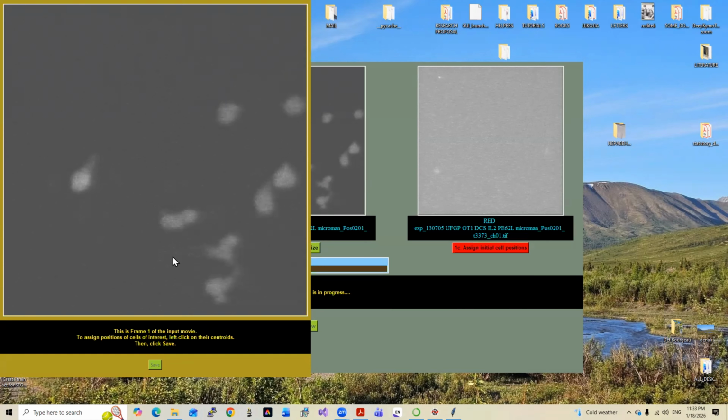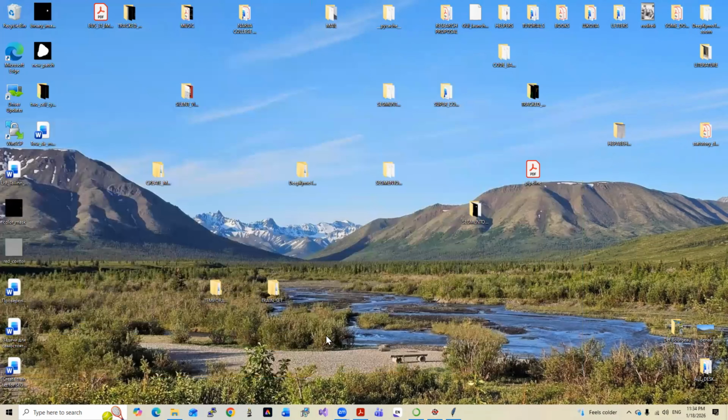In this video, however, I'm going to click only on one cell because the more cells the tracking algorithm has to process, the slower it becomes. And my old desktop is not powerful enough to cope with many cells. It slows down quite dramatically, which would be quite annoying. But if your machine is more modern and more powerful, and especially if it has at least one GPU, everything will be working just fine. So now I'm clicking on this cell and closing this window.